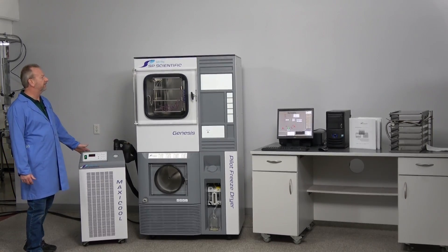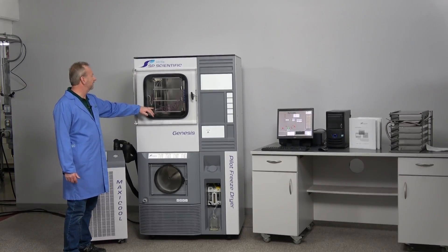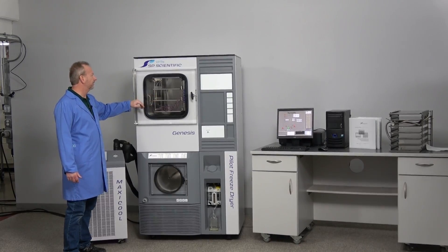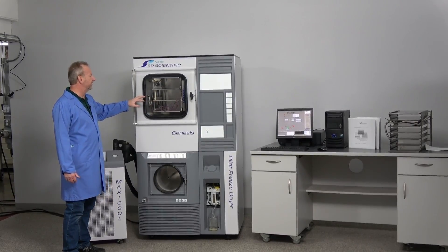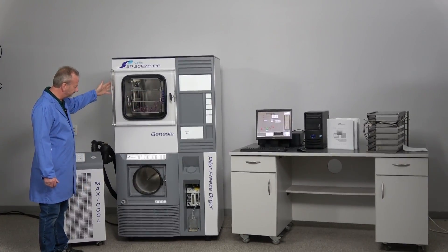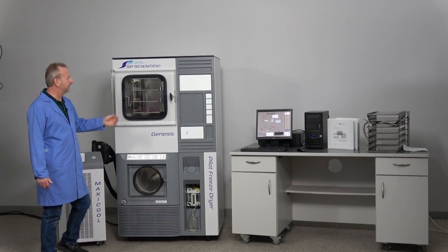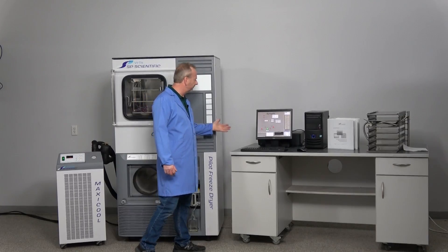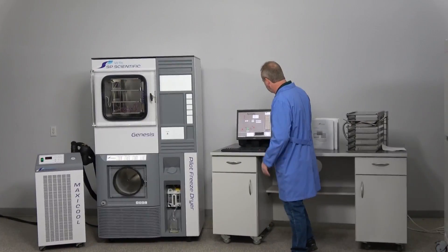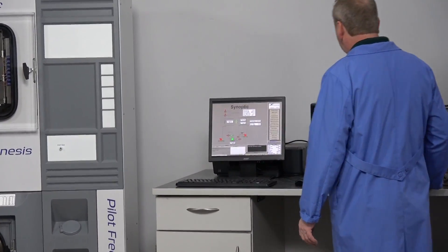Over here you can see it has three shelves right now, but another option it comes with is a six-shelf configuration, which is right there on the end of the table. The machine runs off the Encore software over here, and we're going to look at the software because it has all the hours listed.